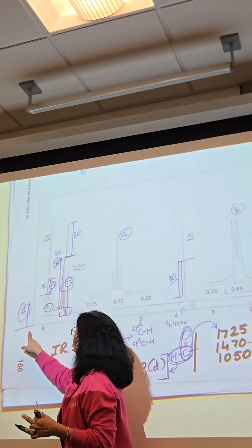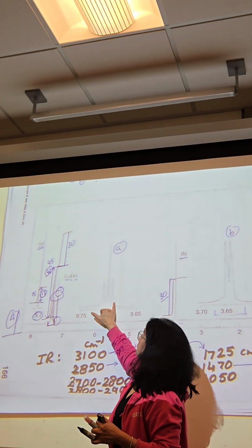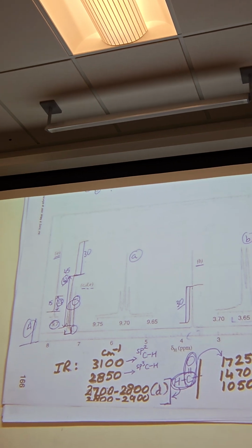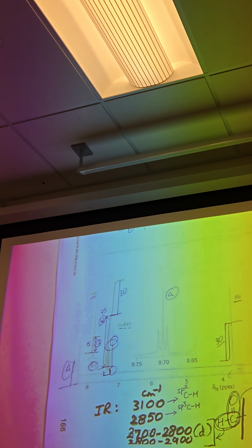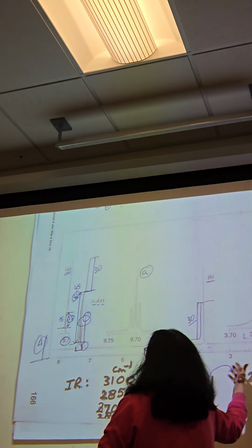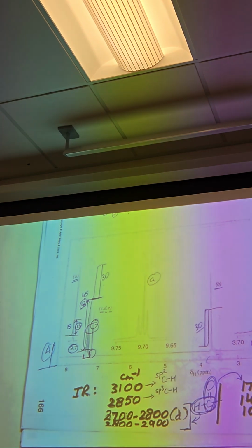Do you see 1, 2, 3? Because sometimes when the splits are too close, you can't see it. So you can highlight that area and zoom it up so you can see it better. Everybody seeing that? Okay, let's go to B. Where is B? B is to the right. I want to go in order. Can we just go in order? C, D, E, and then I'll do B.